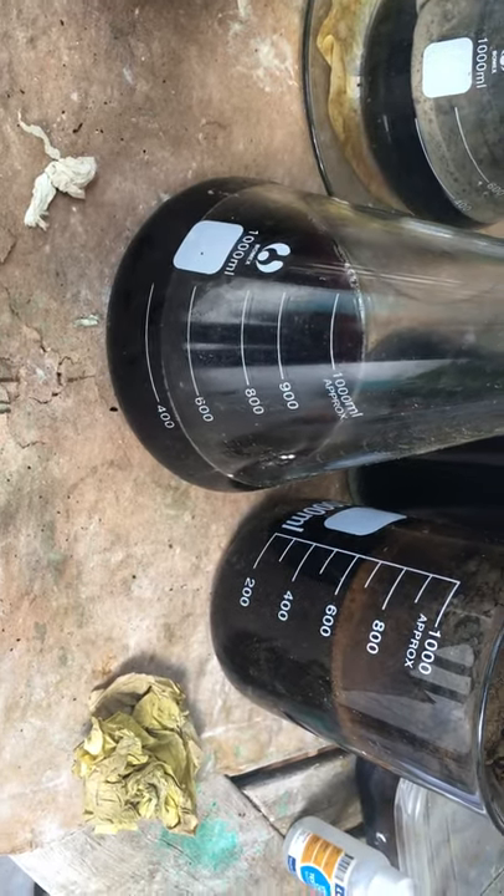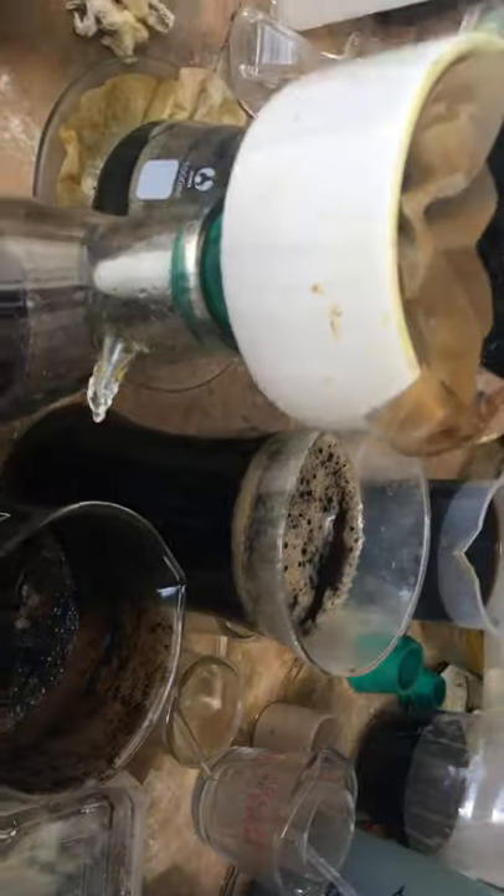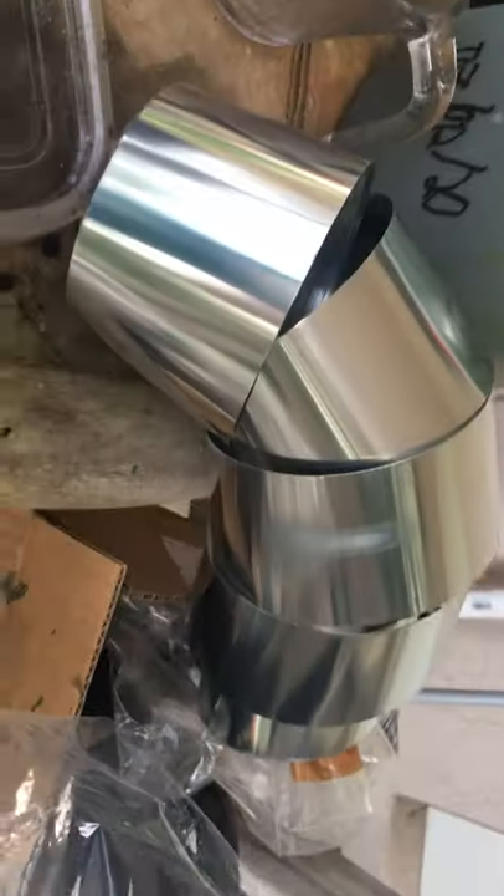Solution with PGM in gold, based on these guys here. Precipitated with zinc, like this. This is it.